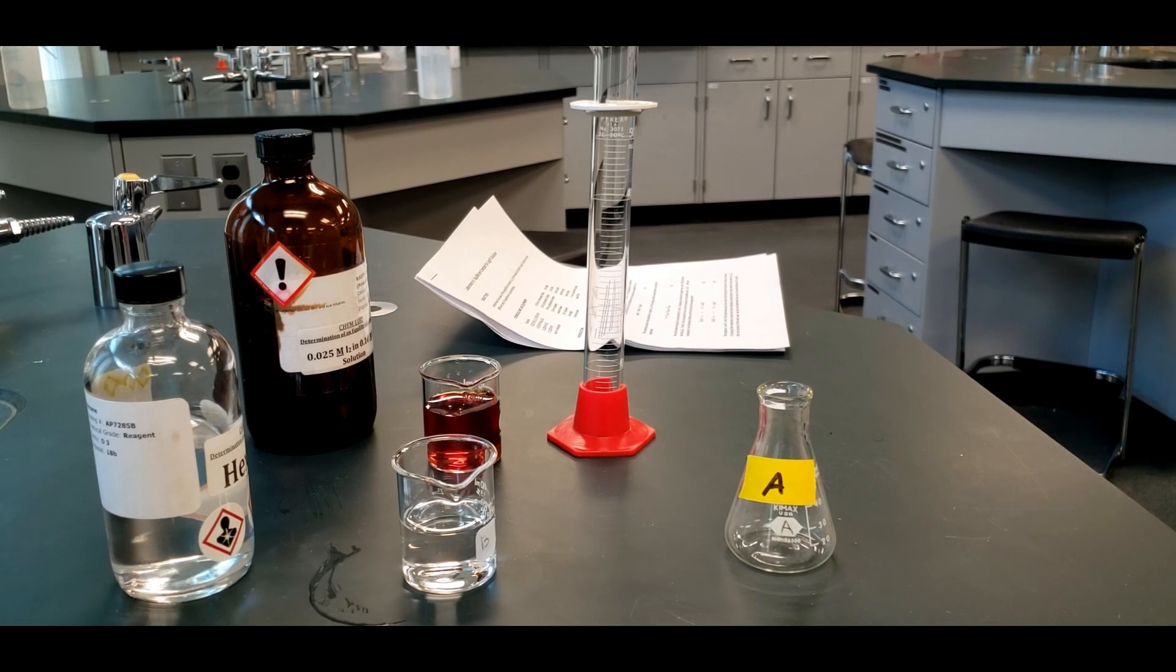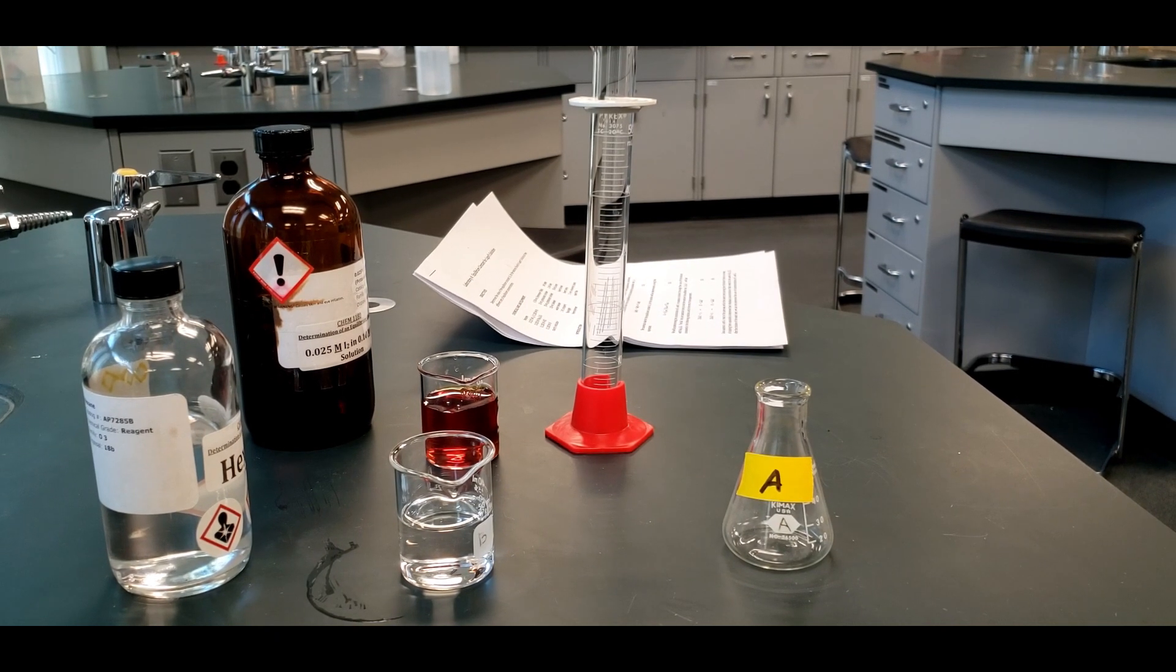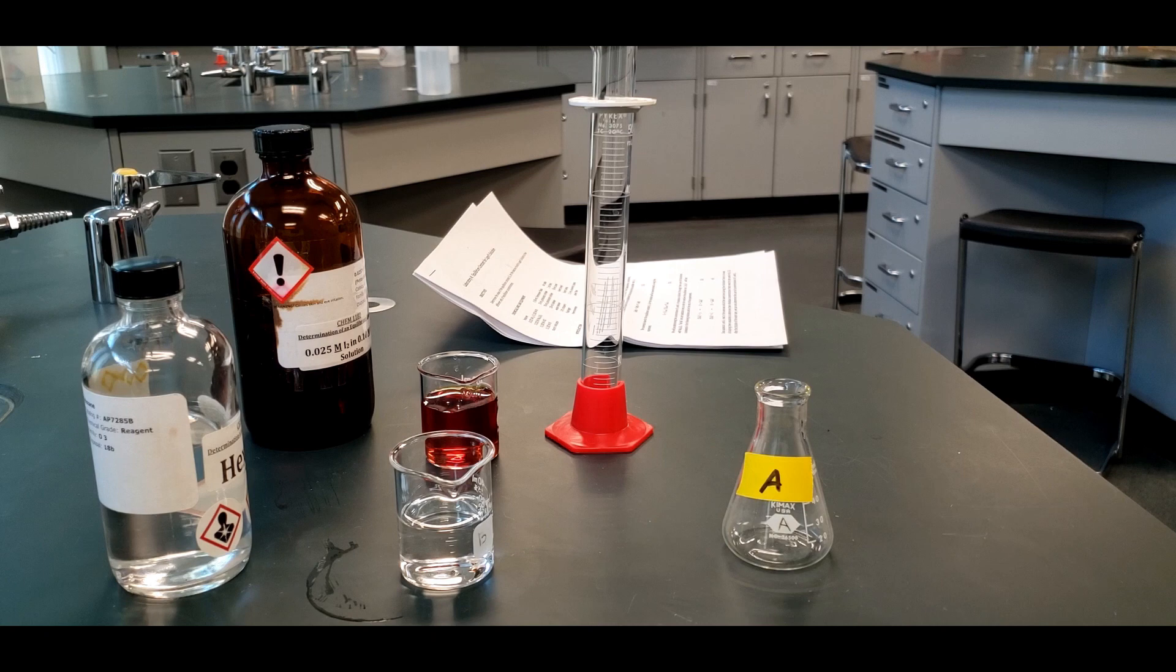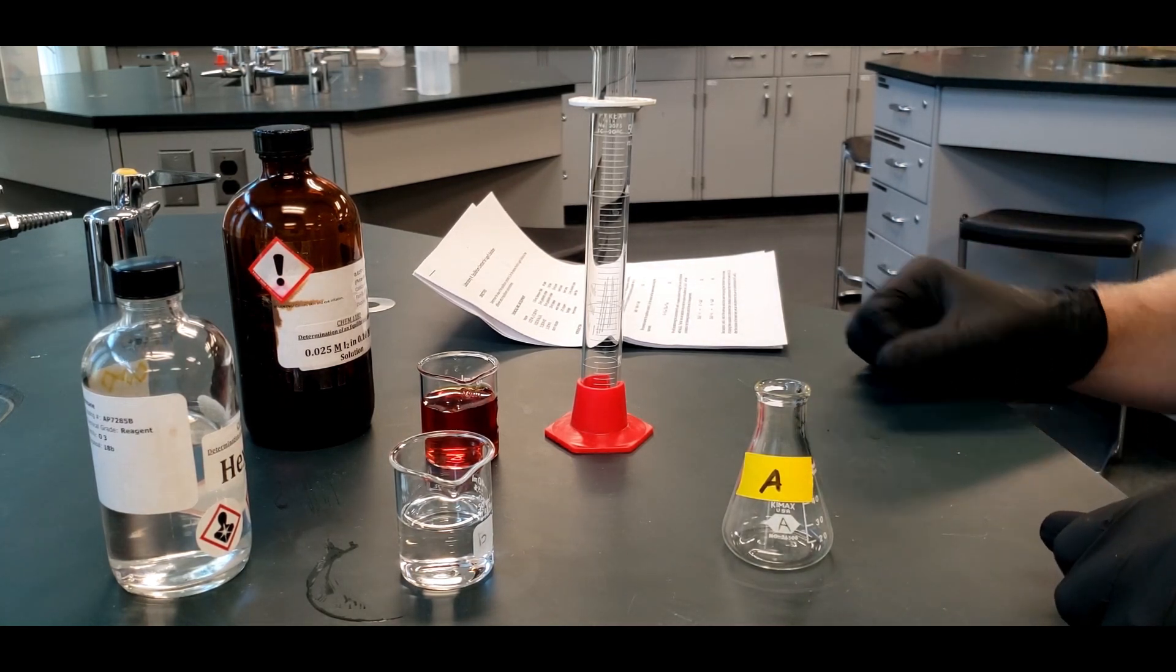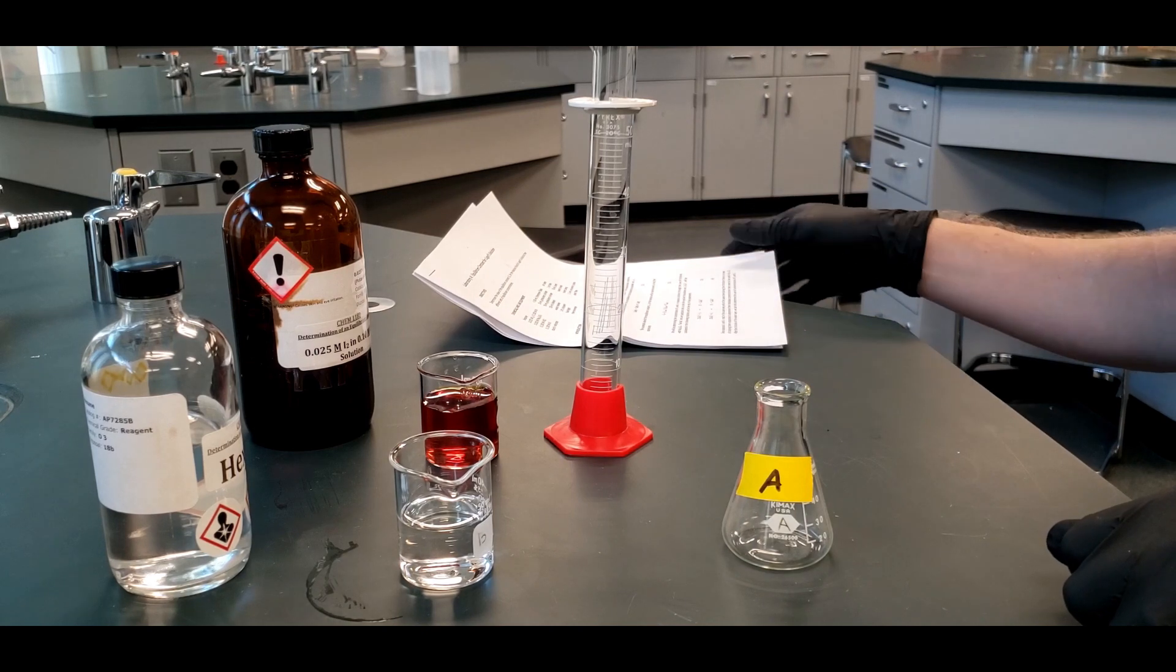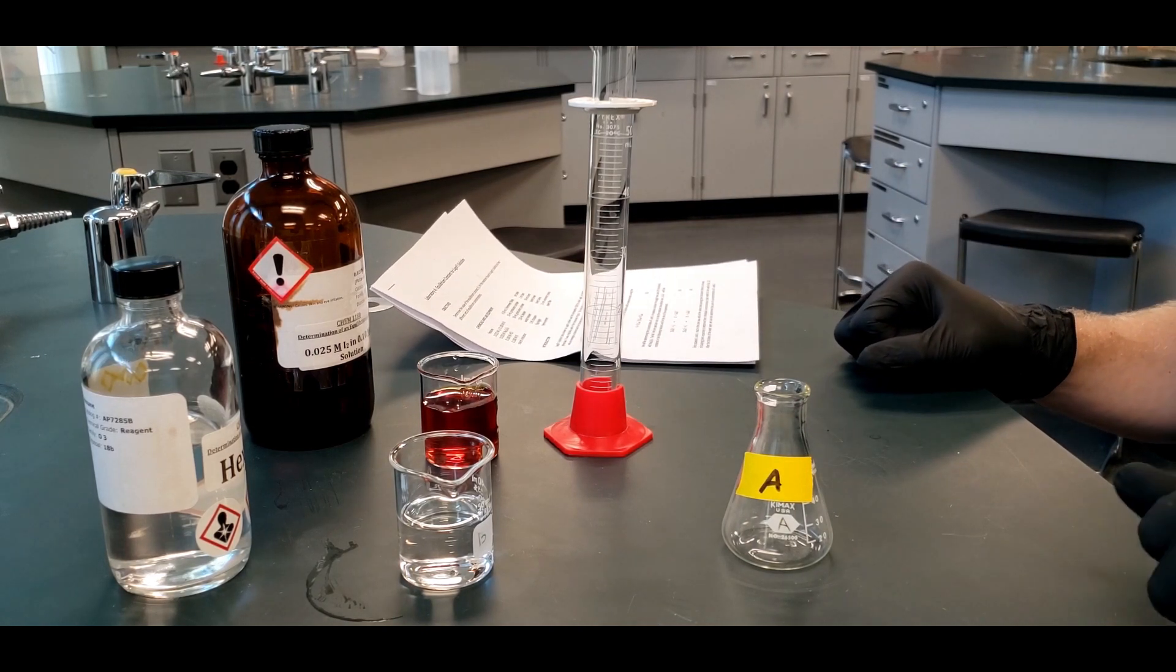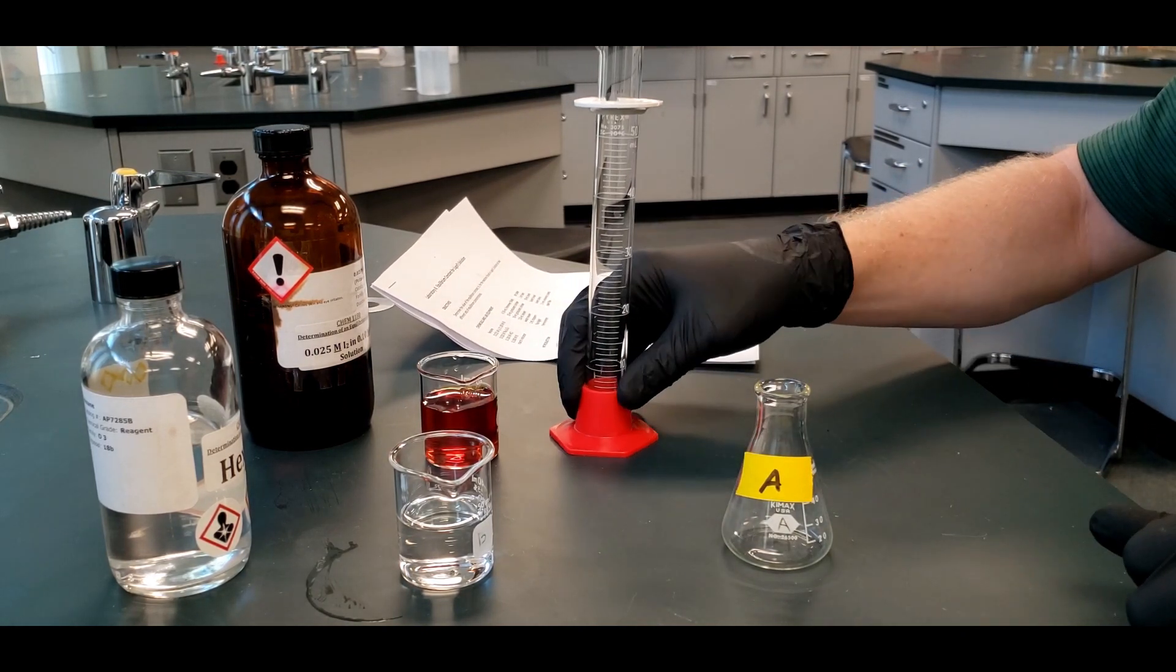This is the equilibrium constant for Lugol's solution, and we're going to be determining the Kc for the equilibrium between iodine, iodide, and triiodide in water.